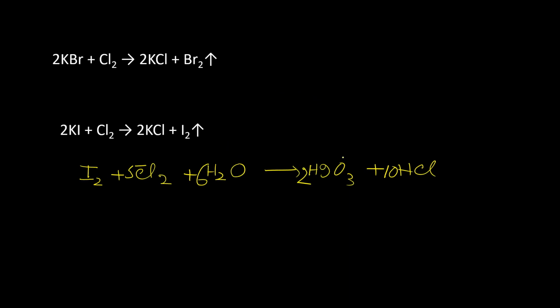So these are the confirmatory tests for chloride, bromide and iodide. Hope it is clear. Thank you.